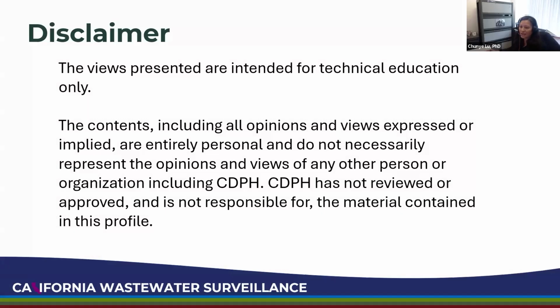And today, my team from the State Lab will walk you through our laboratory procedures for wastewater surveillance testing, demonstrating how we process wastewater samples to produce surveillance data from the moment we receive the samples to the final reporting of the data. Before we proceed, please note this disclaimer.